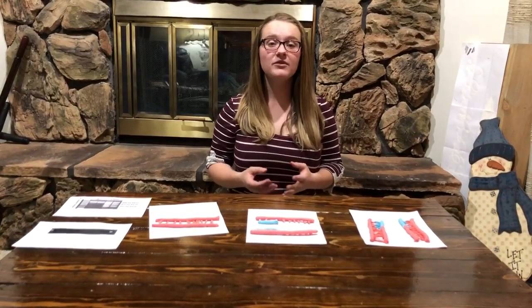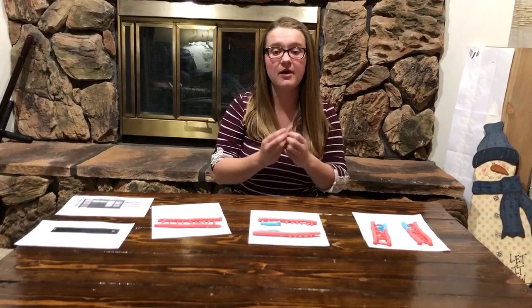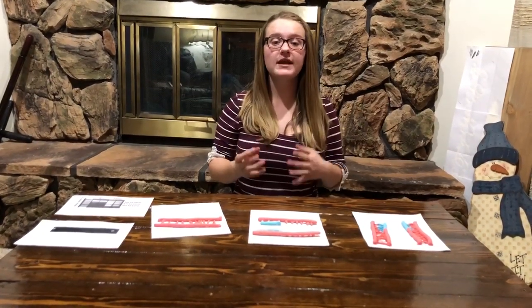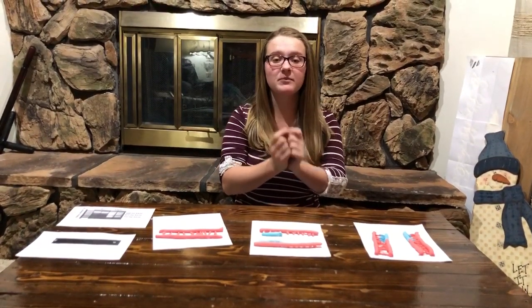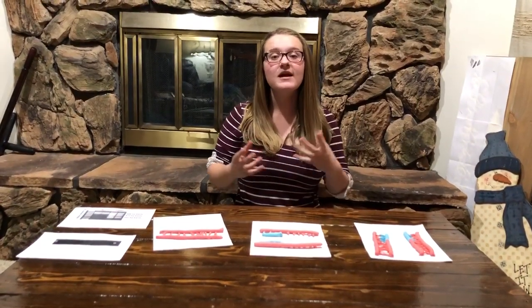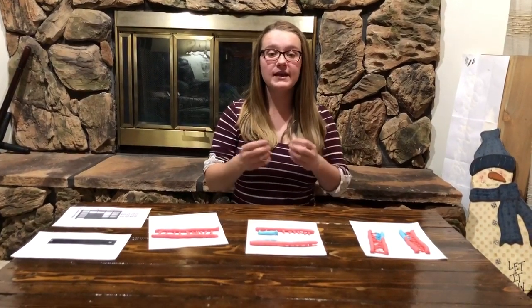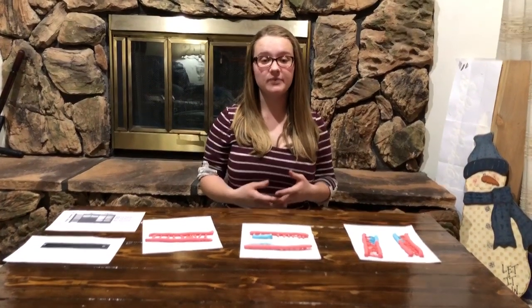PCR was a revolutionary process. It has been the building block that all of today's microbiology has been built off of. PCR can take the tiniest amount of DNA and make mass amounts. It is truly an amazing process. It takes a tiny microscopic piece and makes it so we have the ability to test and view it. It can also detect if there is DNA in a sample. This is known as qualitative PCR.